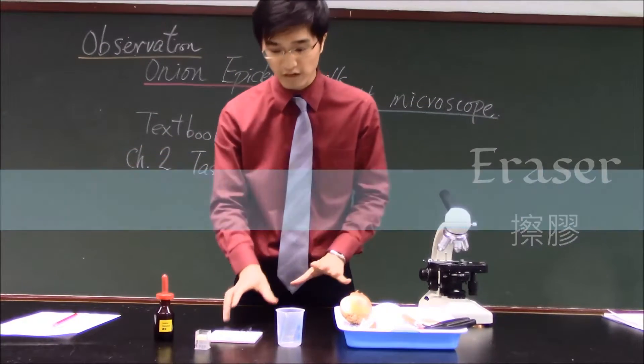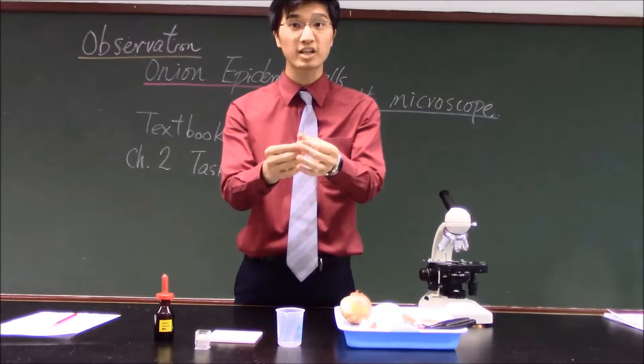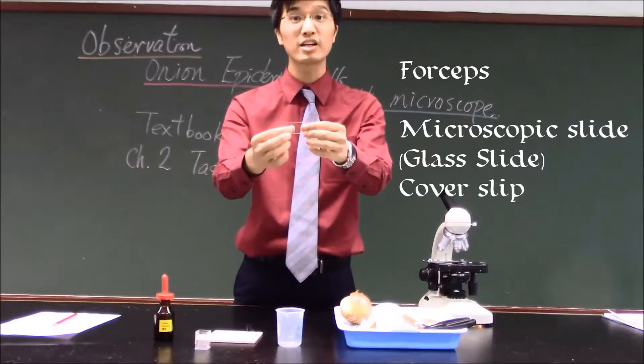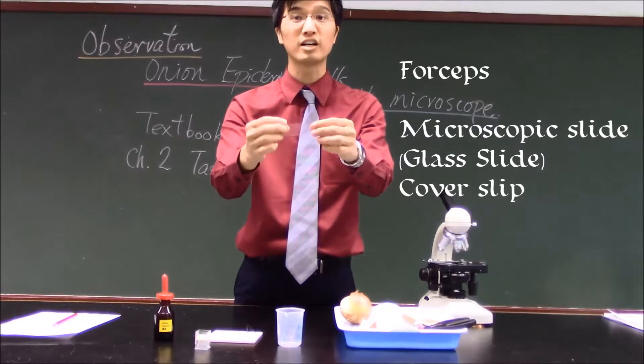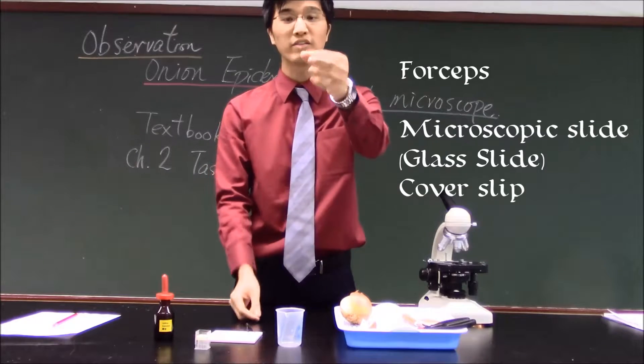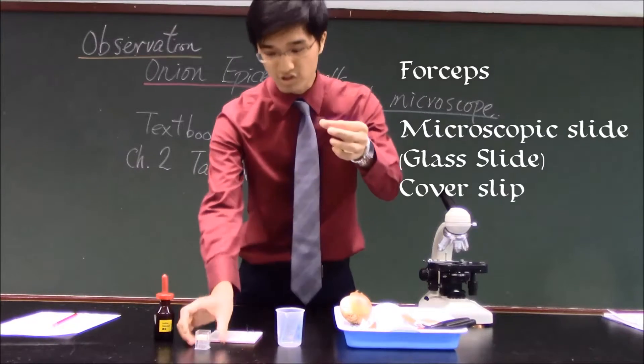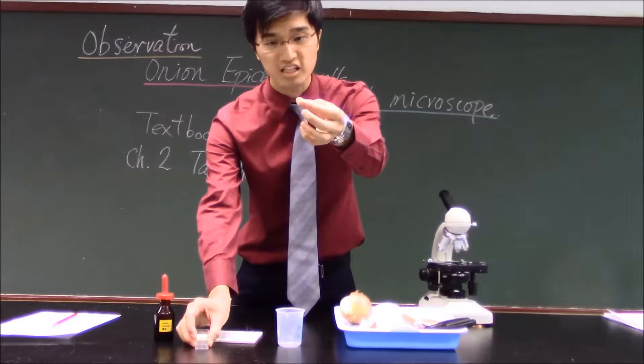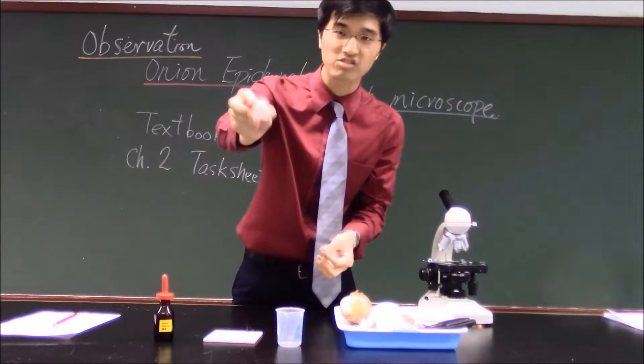So in the laboratory, you will be provided a forceps, a microscopic slide - beware that, because it is made up of glasses, and a very tiny one, the cover slip. It's very small, so you may not be able to see it now. That will be stored here.